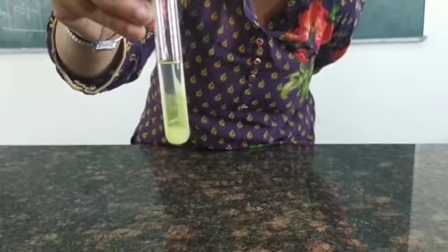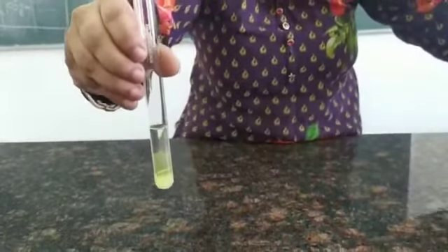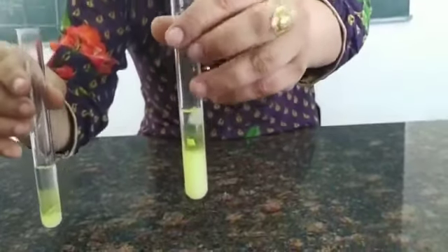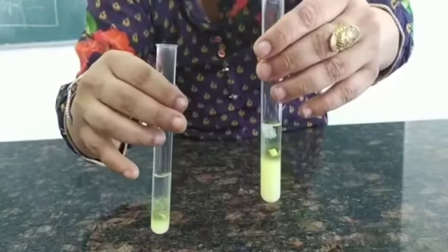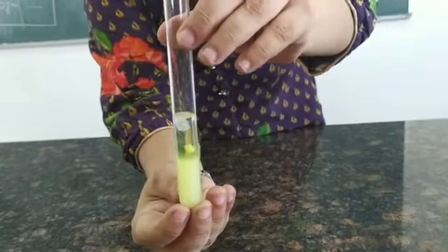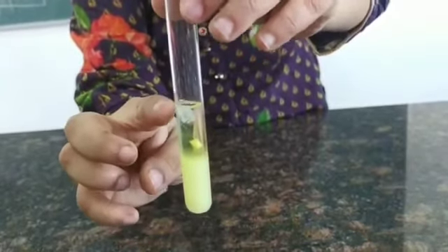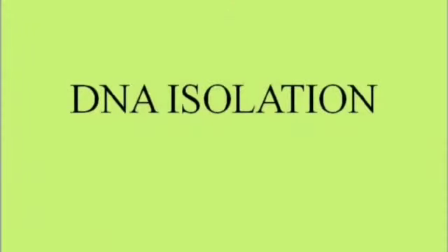We leave the test tube for 10 to 20 minutes. In the solution I have already added the chilled ethanol and kept it for 15 to 20 minutes. As you can see clearly, on top in the ethanol layer you can see the entangled mass of DNA — the white substance floating at the top. This thread-like entangled mass is the isolated DNA.